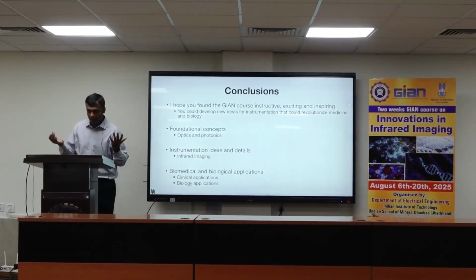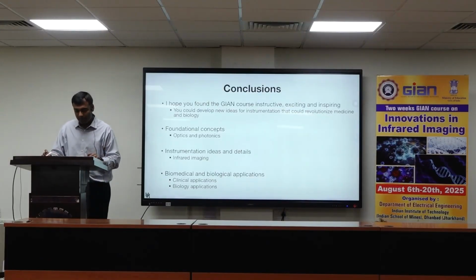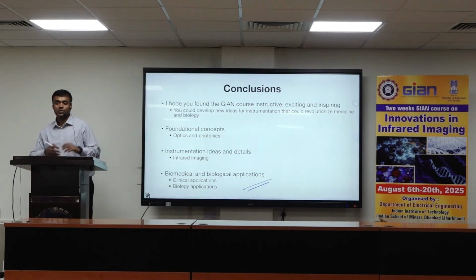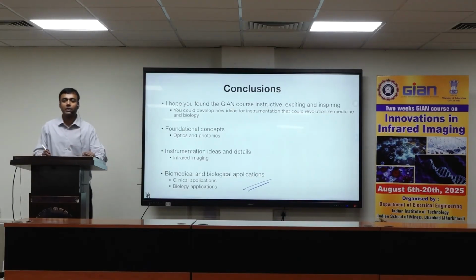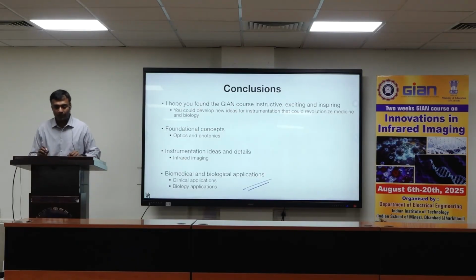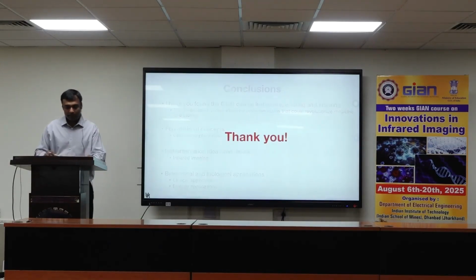We talked about OCT, mid-infrared imaging and many related imaging methods. I gave you examples of many biomedical, clinical and basic biology applications, and we covered a large breadth of topics. I hope this was instructive as well as inspiring.